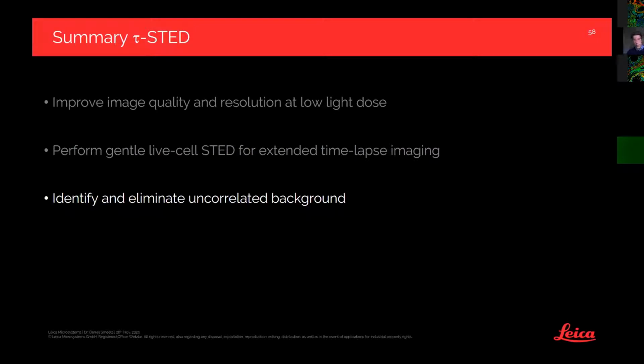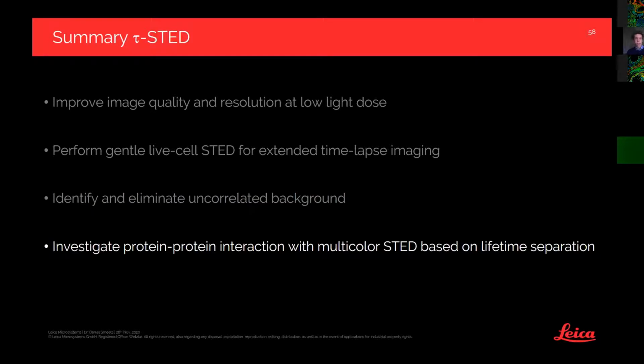You can, at the same time, thanks to the Phasor analysis, easily and without any fitting, identify uncorrelated background, so lifetimes which are not affected by the absence or presence of your STED laser, and which can therefore easily be removed from your image to improve signal-to-noise ratio. And you can also combine things like FLIM FRET or multicolor separation using the lifetime, also in STED microscopy. And this will be something that Mariano is going to show you also.